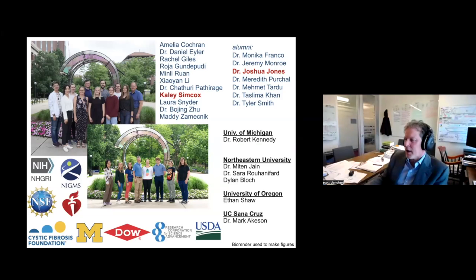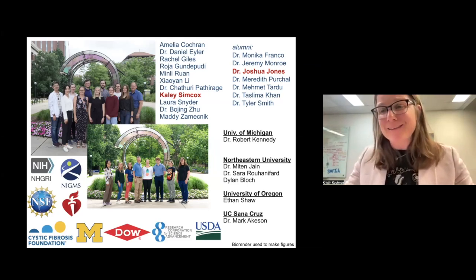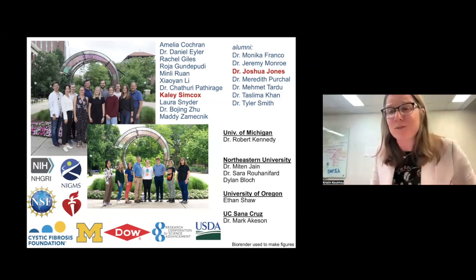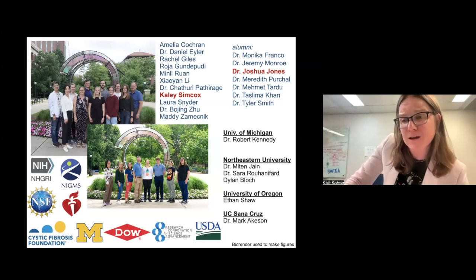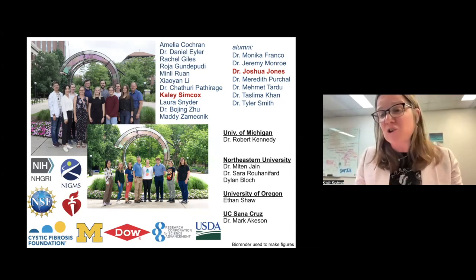And finally, do you find the same sensitivity when you use HILIC separation compared to IP reverse phase separation for your oligonucleotide analysis? No, it's definitely better with IP, but the disadvantage of IP is that I run everything on a core instrument, right? We have a triple quad in lab, but I don't have an Orbitrap. And so they won't let us run ion pairing reagents. I think no core I know of will let you run ion pairing reagents. And so HILIC enables us to have pretty good sensitivity and do it on any instrument.